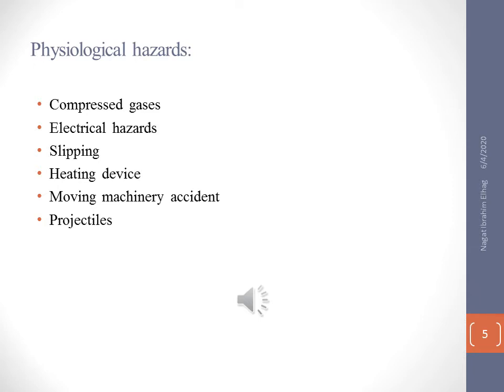For example, compressed gases must be kept in special cabinets, and also, as I mentioned before, chemicals must be stored in ventilated cupboards to avoid any fires in your lab.